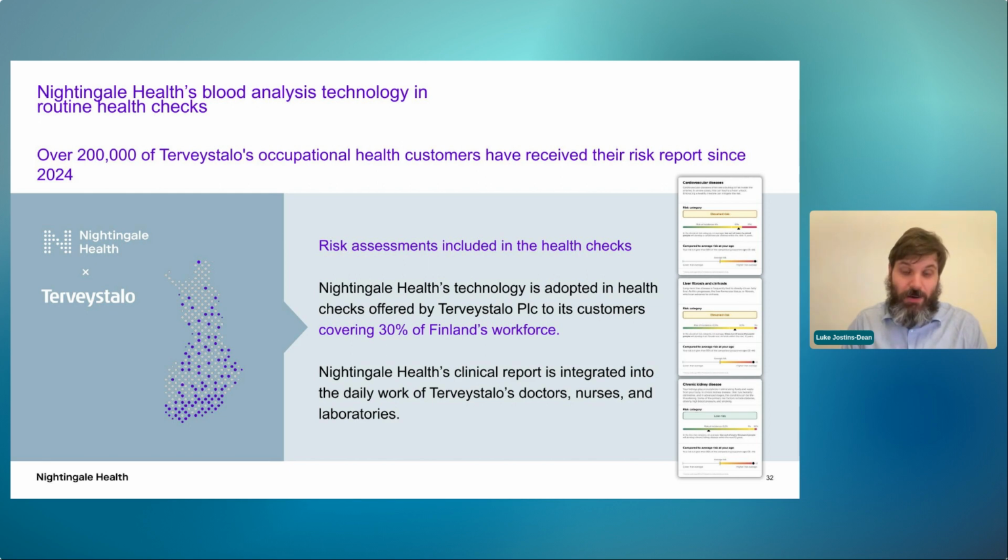And so now we've been working with this company that provides one of these major sources of occupational health, and around 30% of the Finnish workforce is now receiving NMR-based assessments of risk. That's 200,000 people so far who have received these results.